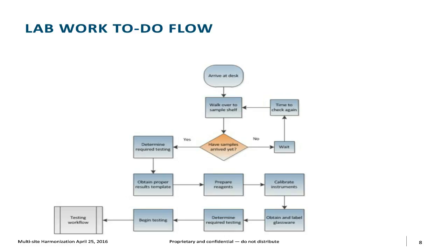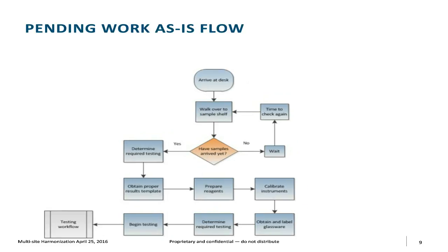So as I said, these workflows are, for good or ill, what they are. Looking at this, one thing that becomes obvious to us was that wait state. And this is as we look for opportunities for process improvement. We think, well, what could a commercial LIMS bring to the system? And when we design the future state workflow, what we want to do retrospectively is look at the as-is workflow for things that kill people in terms of productivity. And wait states are the most glaring example of this.